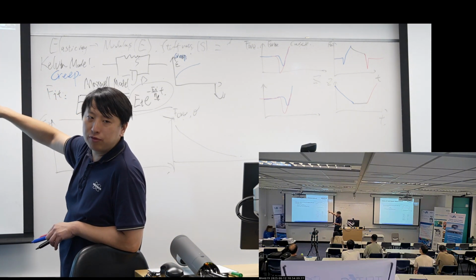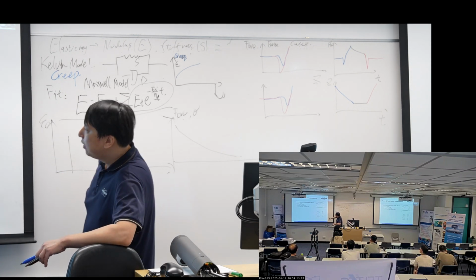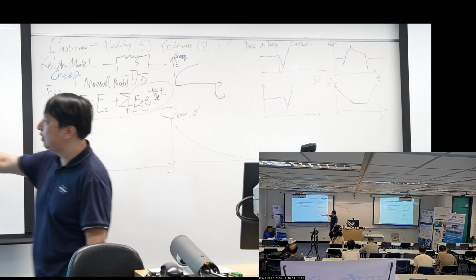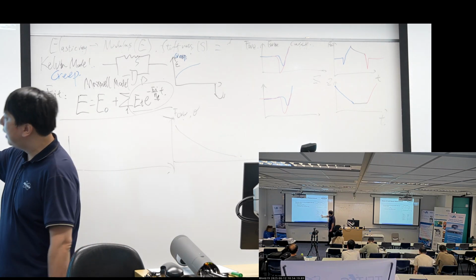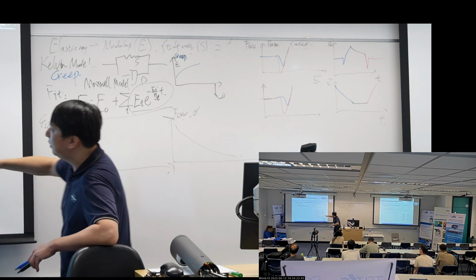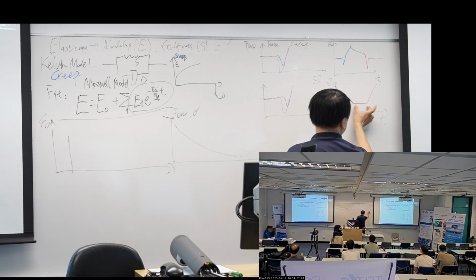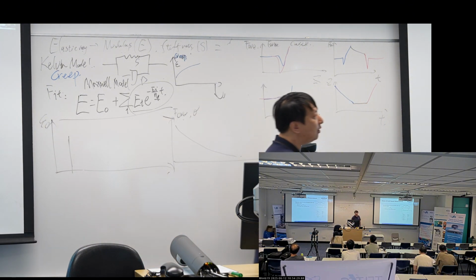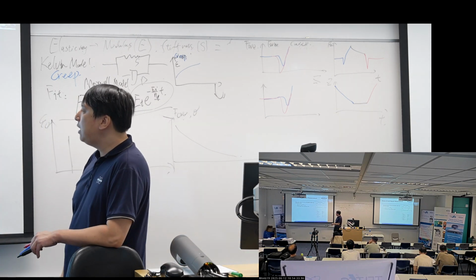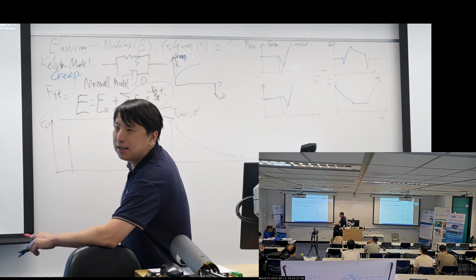In the ramp and hold function, you can see in the MCPF icon, we have a parameter set called surface control. Inside the surface control, we can type in the hold time, how long I want to stay at this distance.